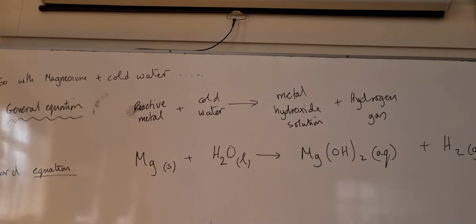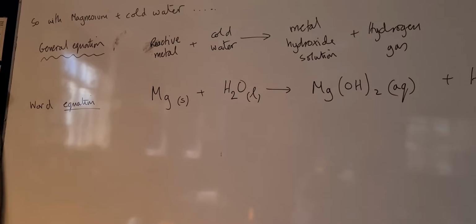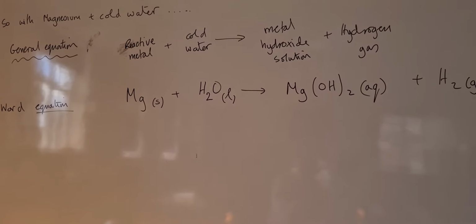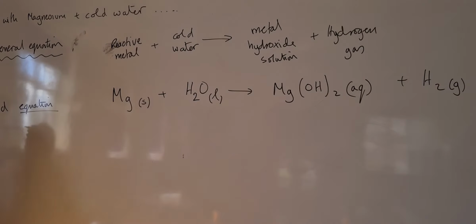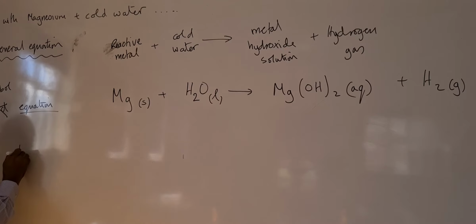Actually, I've got that wrong because I've tried to say it's a word equation. Look, word equation. And it's not, is it? That's not a word equation. That is what we call, that is called a symbol equation. Symbol equation.